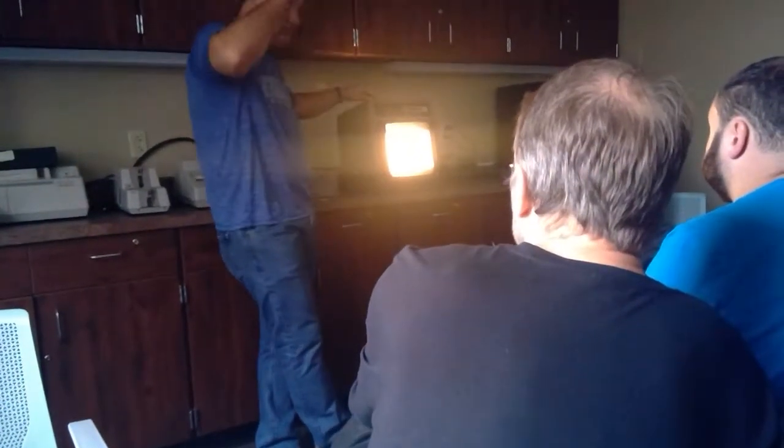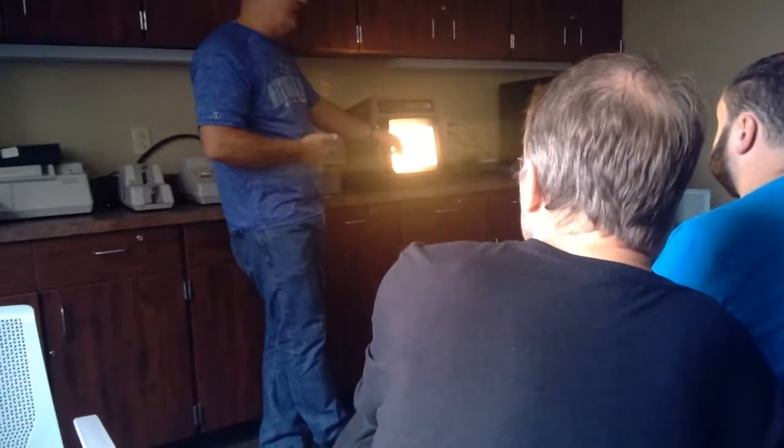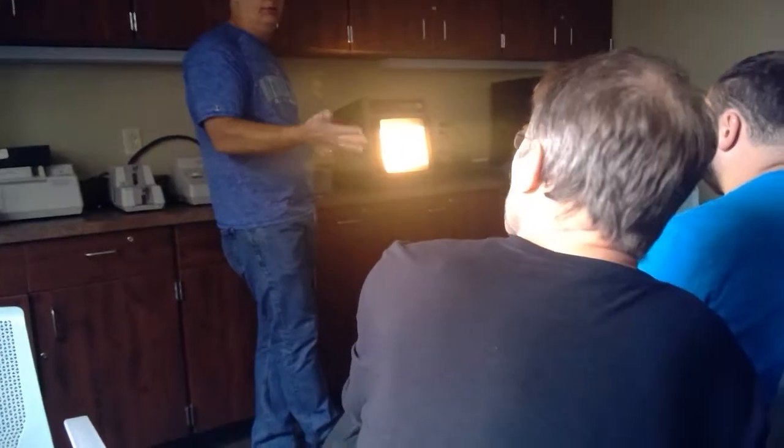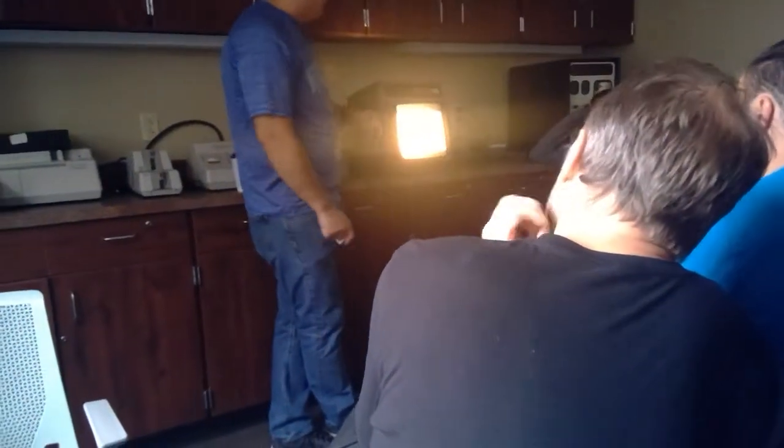Granular. Right. And when I worked, for whatever reason, we had to distinguish one called finely granular from coarse granular. That is a granular cast. We'll see those from time to time.